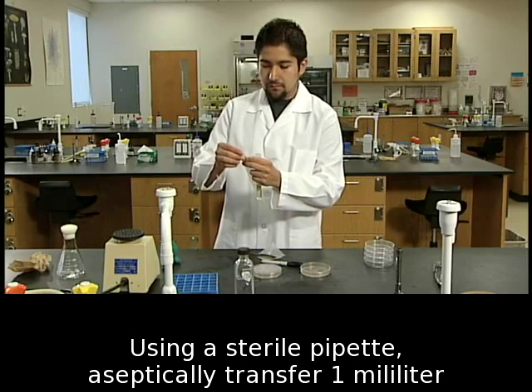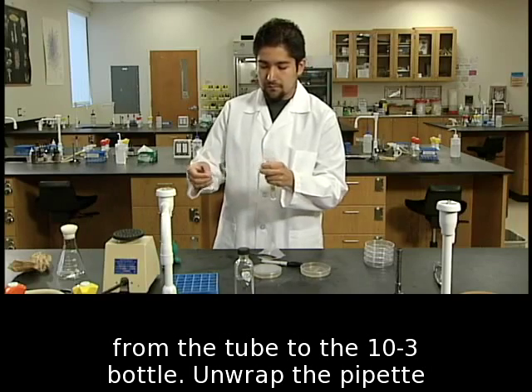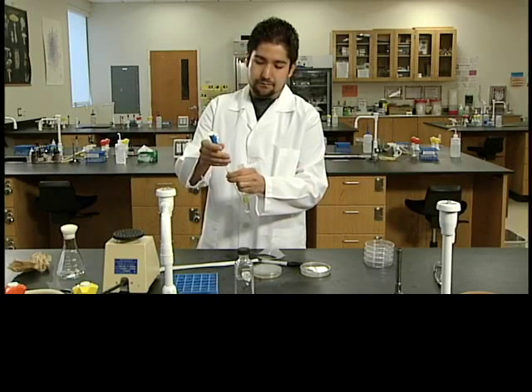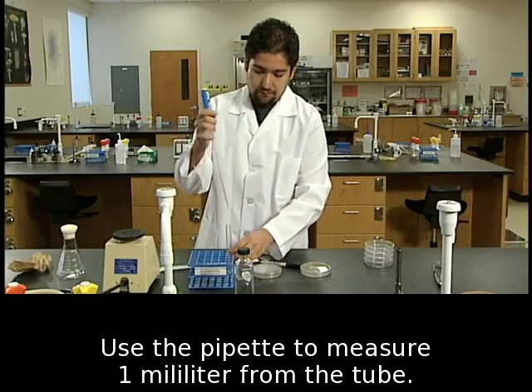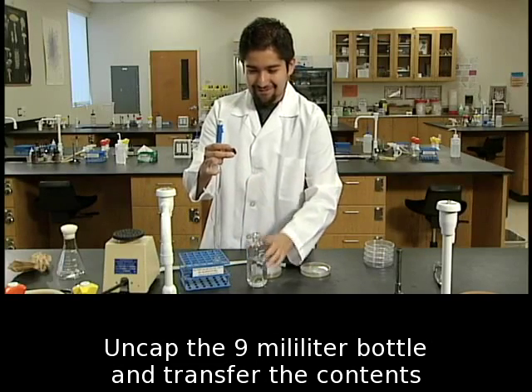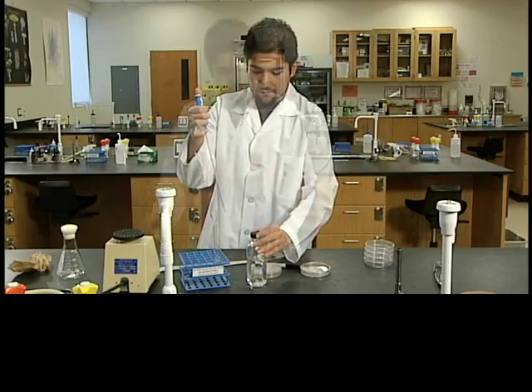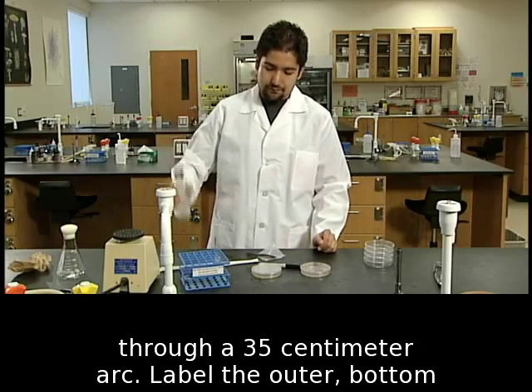Using a sterile pipette, aseptically transfer 1 milliliter from the tube to the 10 to the negative 3 bottle. Unwrap the pipette and attach the aspirator. Use the pipette to measure 1 milliliter from the tube. Uncap the 9 milliliter bottle and transfer the contents of the pipette, and then recap the bottle. Mix the contents by shaking the bottle 20 times through a 35 centimeter arc.